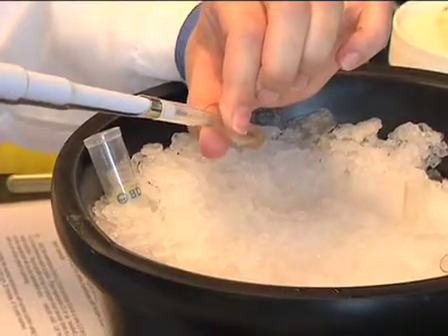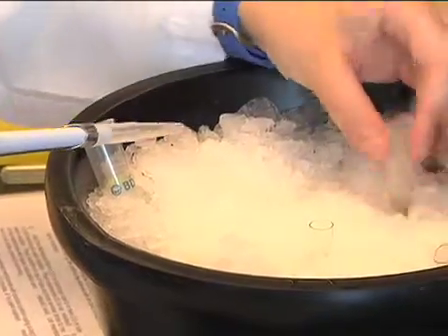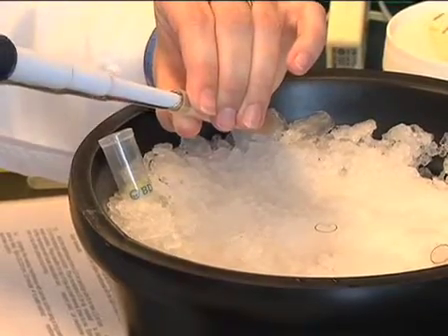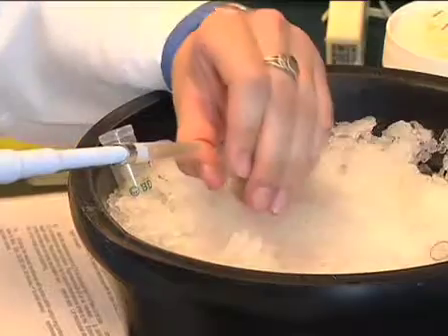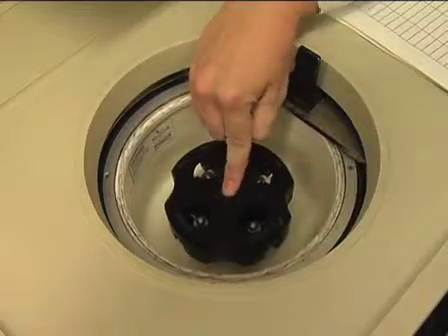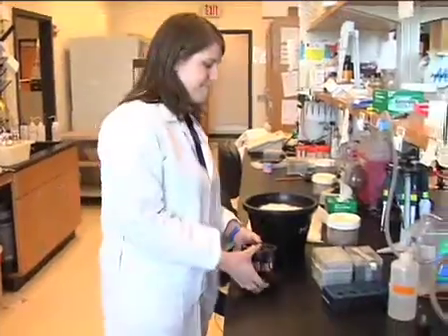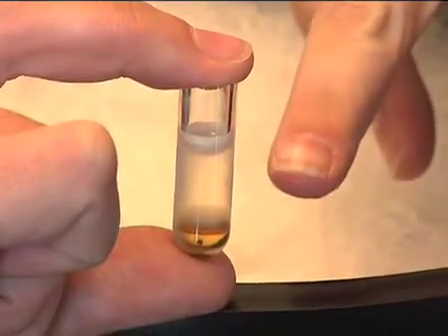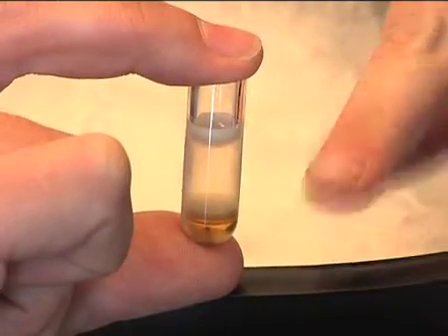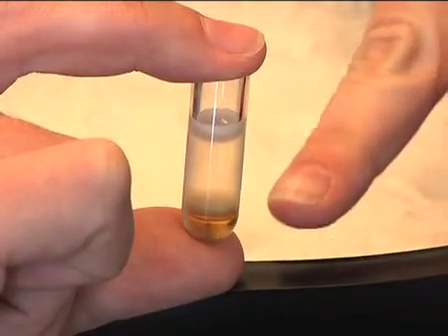To begin fractionation, transfer the crude egg extract to a 2.5 ml ultra-clear centrifuge tube. Centrifuge the egg extract for 90 minutes in a Beckman TLS100 centrifuge using a TLS55 rotor at 55,000 rpm or 250,000 g's at 4 degrees Celsius. After centrifugation, the extract will separate into a clear soluble portion with a pale yellow membrane fraction below, a dark membrane fraction consisting of mitochondria and other organelles, and at the bottom a large fraction containing ribosomes and glycogen.